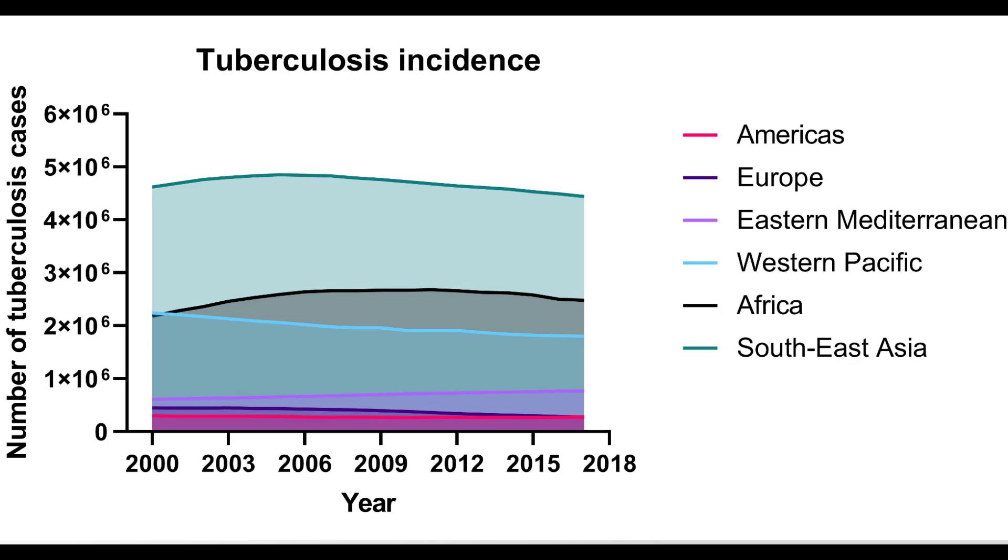My name is Dr. Stephen Bradburn from toptipbio.com and in this video tutorial I'm going to show you how to use GraphPad to create and interpret an area graph.